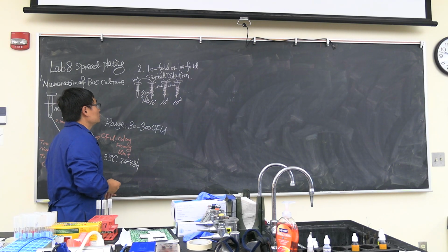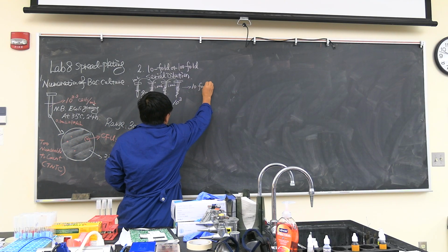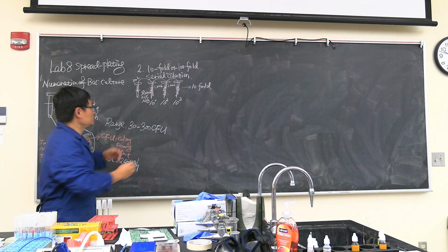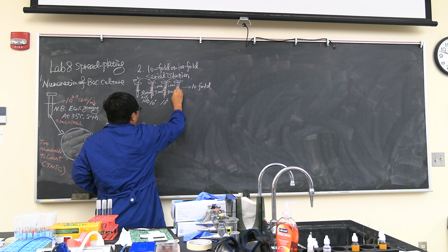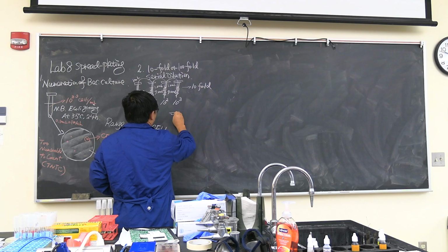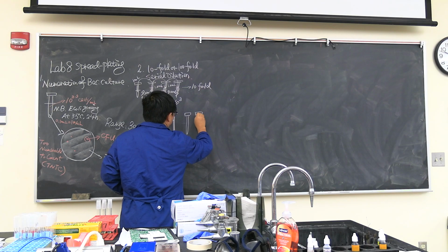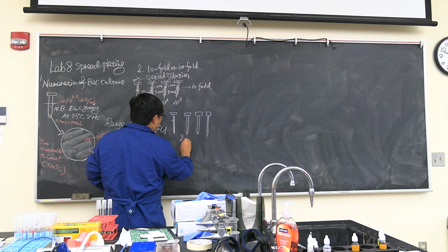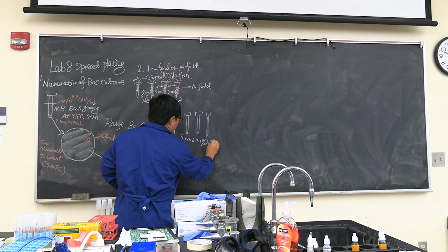Now, we usually also do 100-fold serial dilution. So this is tenfold, and we also do 100-fold. Instead of using a 9.0 ml dilution tube, we are using 9.9 ml. How are we going to do it? We have the original tube, right here. We're going to prepare a bunch, let's say 3, of 9.9 ml of 0.1% nutrient broth.